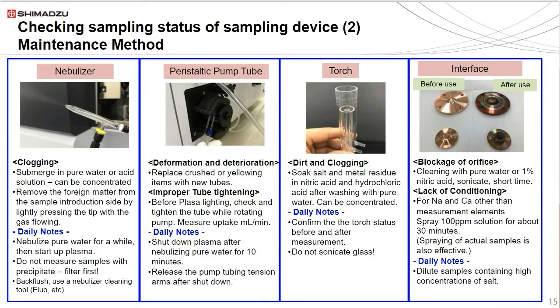If signal is low, consult the help guides with your instrument, but common issues include clogging of the nebulizer. Aerosol performance can be observed by nebulizing water into air and observing the spray, which should be an even fine mist. Uptake rate can also be measured via displacement using a stopwatch and a graduated cylinder. The recommended uptake rate for most nebulizers can be found in the specifications sheet and can be altered by changing the pump speed or the nebulizer gas flow.